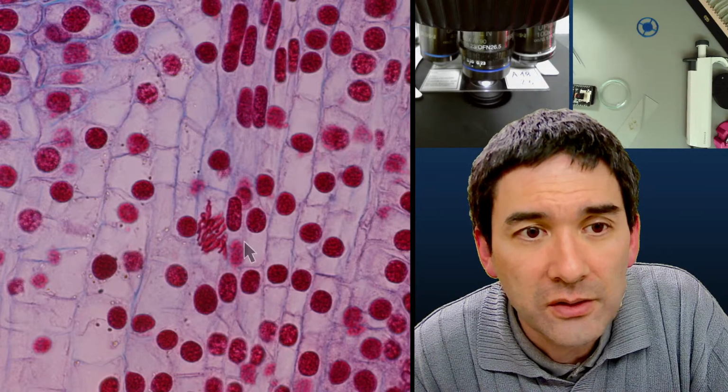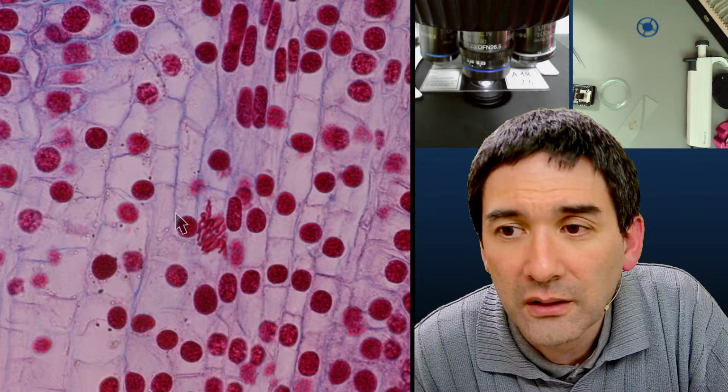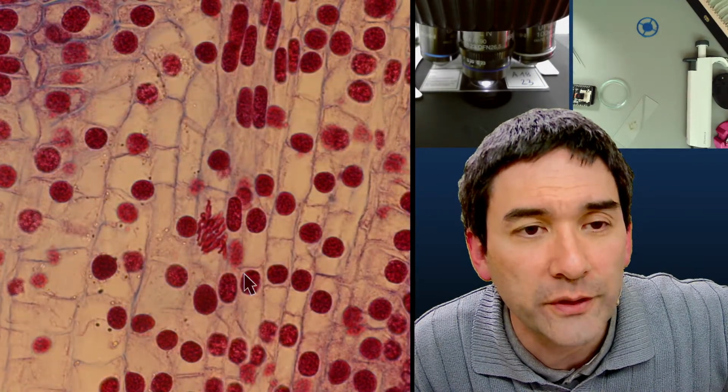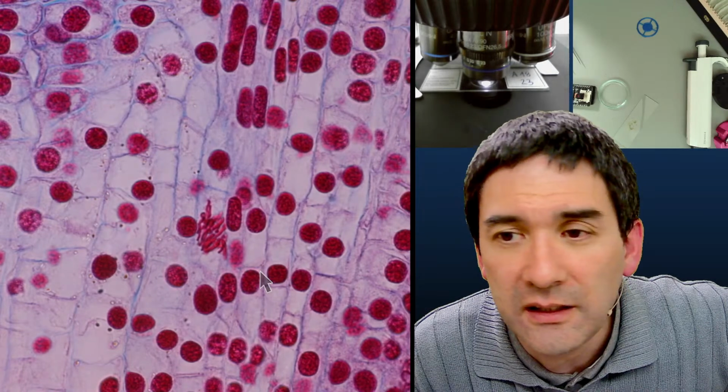And here you see these are chromosomes, those lines that you see here. I'm using DIC right now. That's why the colors change. But you see there is not a huge difference. So you see that not every technique is ideal for everything.